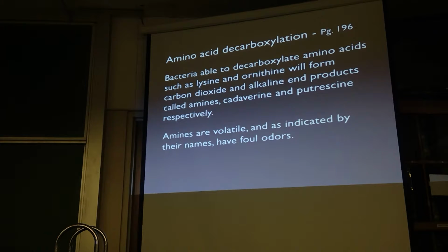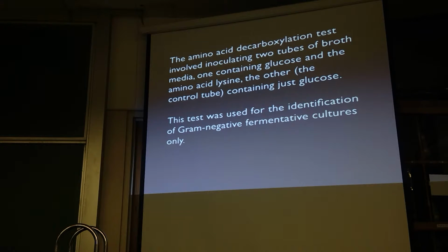So if your organisms are decarboxylating lysine, they're producing cadaverine. It still smells bad. This involved two tubes. You had one tube that had lysine plus glucose, and you had another tube that just had glucose. The one that only contains glucose is called a control.